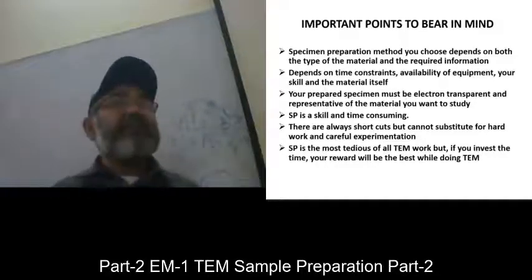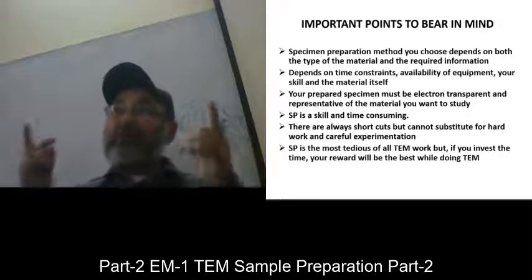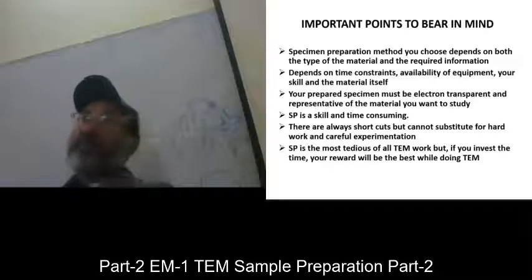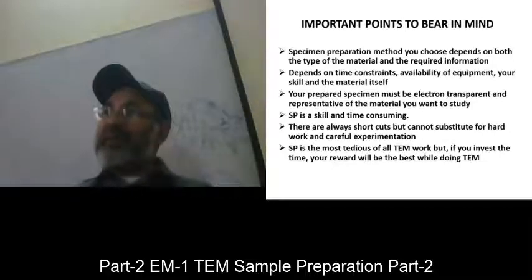There are many other things as well. So your sample selection must be representative of what sort of information you are giving.